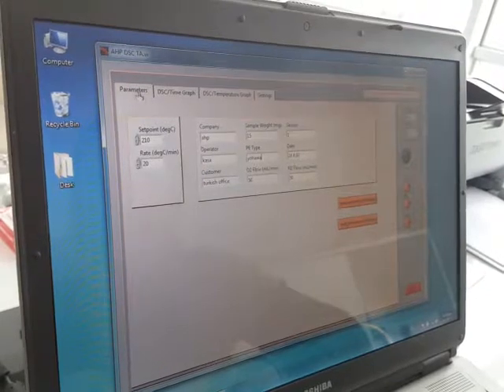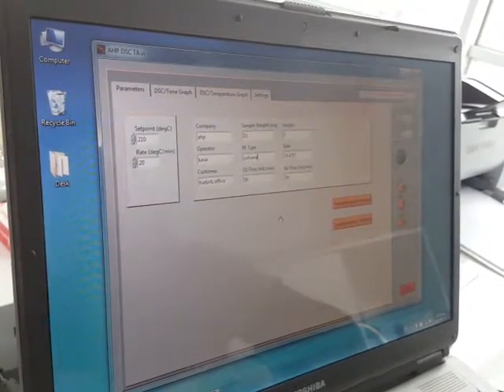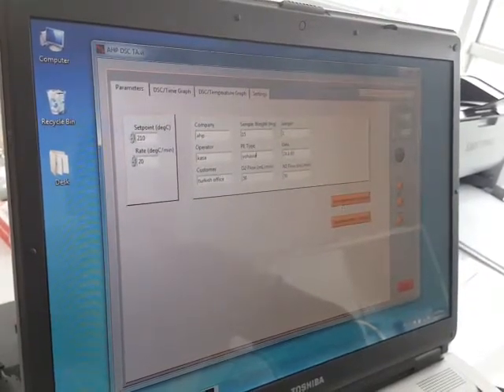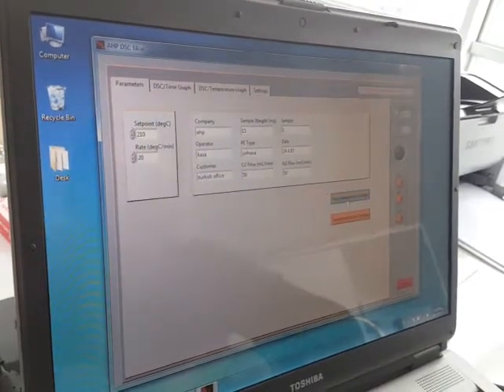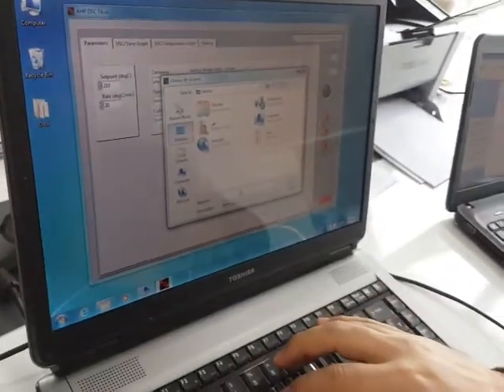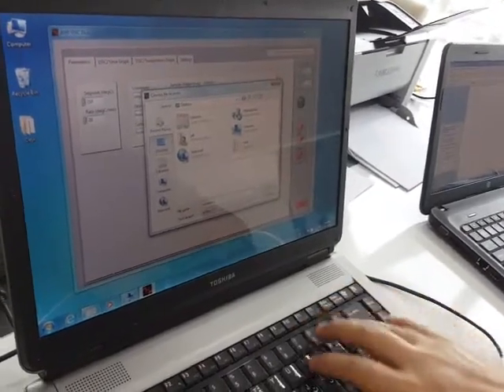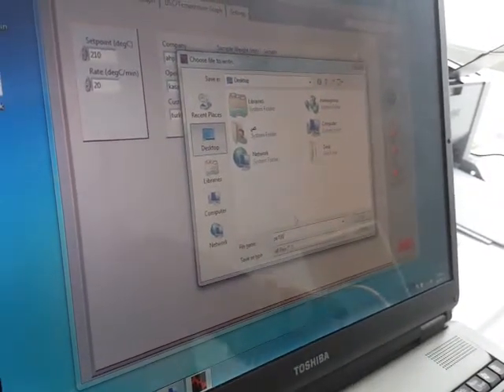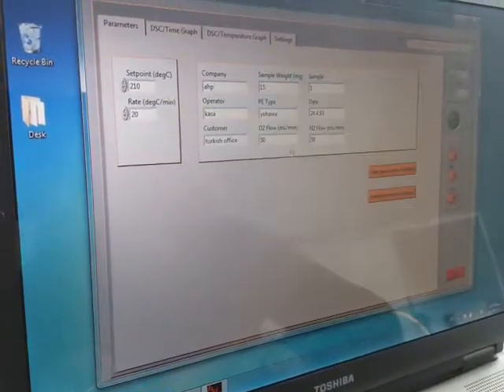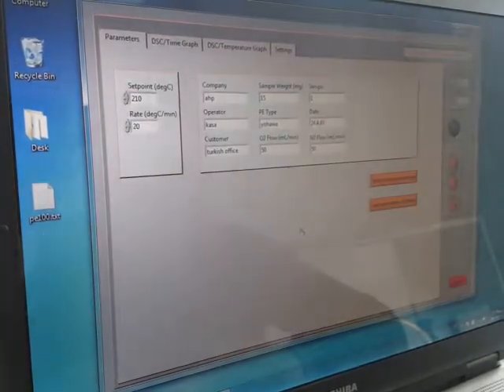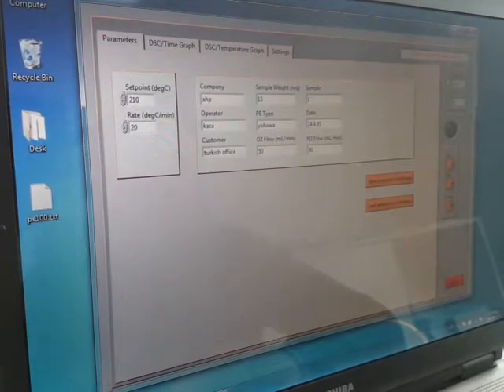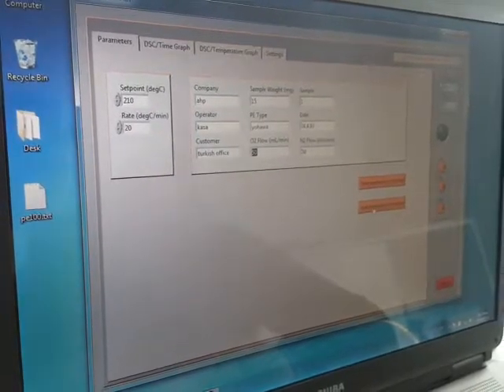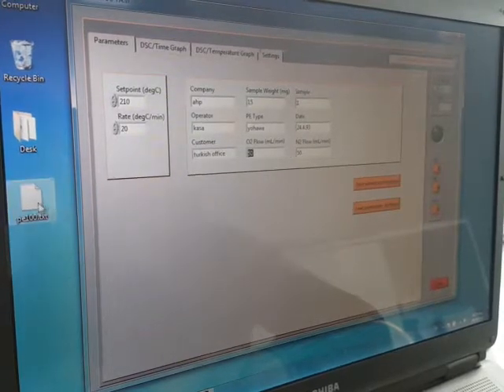In the first page you will have the general parameters of the sample. The operator can easily save these parameters in a text file. You can see here I'm saving the sample parameters such as p100.txt. It's a text file including parameters. Next time the operator can load the text file for changing these parameters - there is no need to write here. You can easily load text file and all parameters will be set as saved.